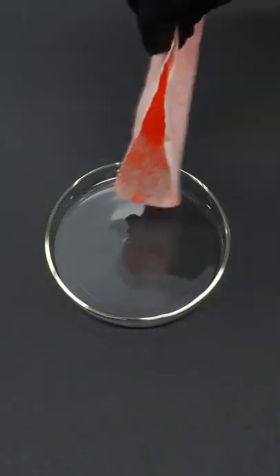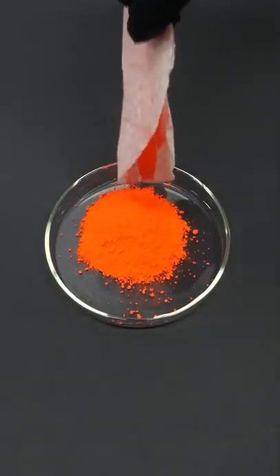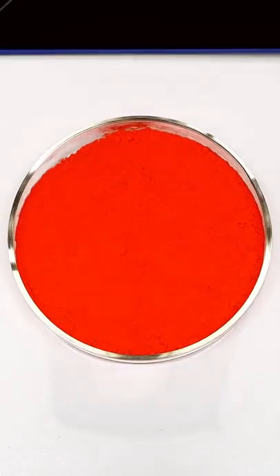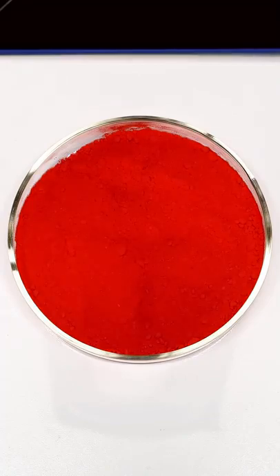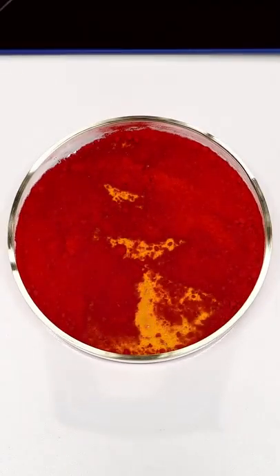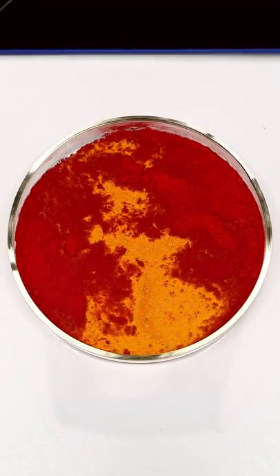To make this happen, all I have to do is pour all of it into a dish and spread it around. I'll then put it on a hot plate, and I'll crank up the heating. As it warmed up, it slowly turned to dark red, and when it eventually got hot enough, some of it started turning yellow. This yellow part then kept growing, and the red color slowly disappeared.